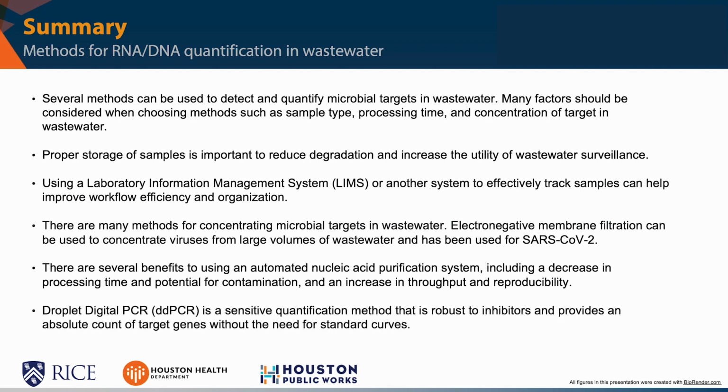And finally, droplet digital PCR is a sensitive quantification method that is robust to inhibitors and provides an absolute count of target genes without the need for standard curves.